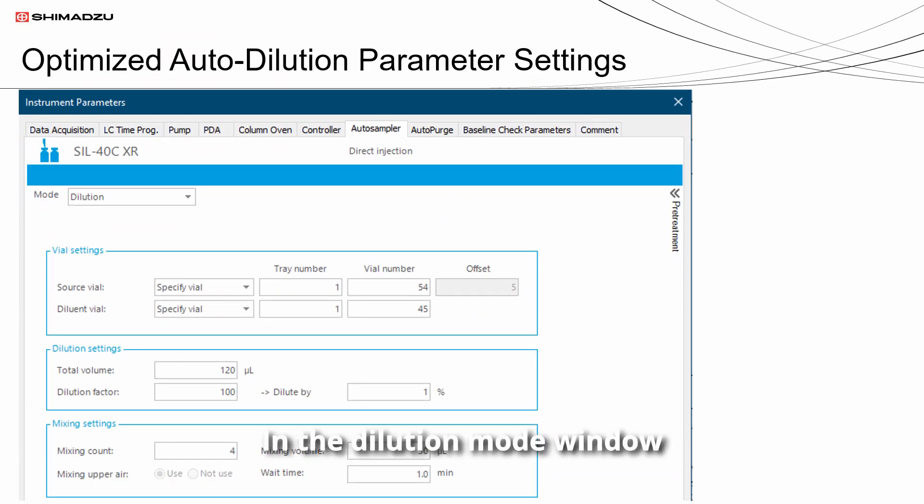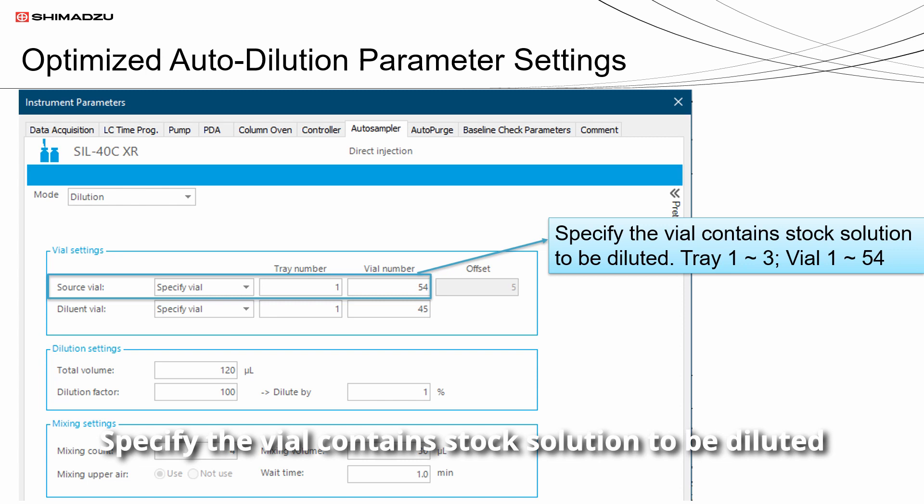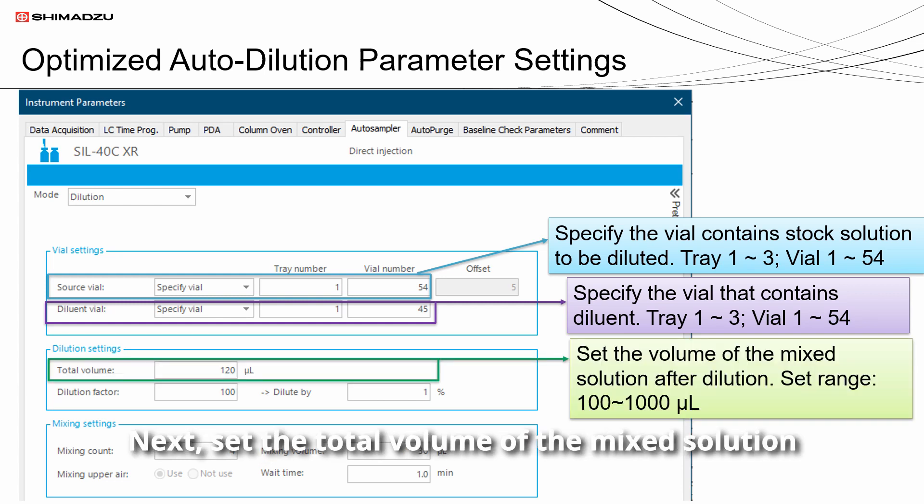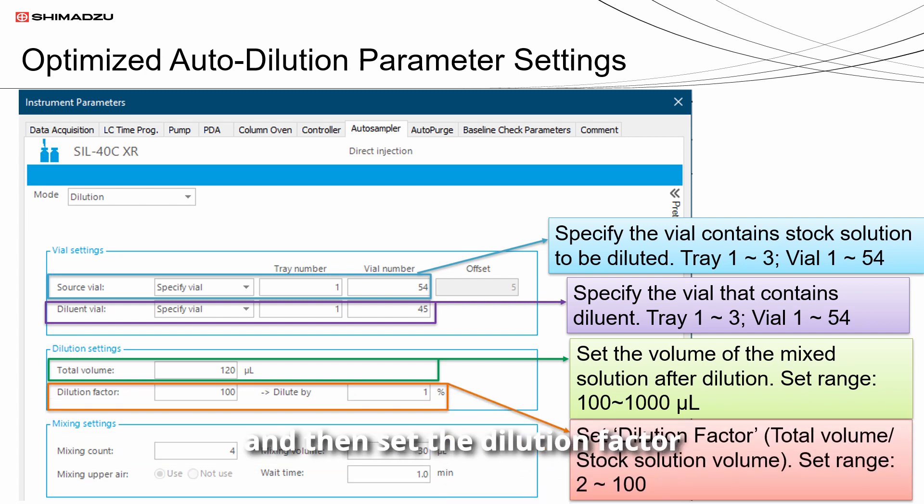In the dilution mode window, specify the vial that contains stock solutions to be diluted. Then specify the vial that contains diluent. Next, set the total volume of the mixed solution after dilution. Setting range is 100 to 1000 microliters. Then set the dilution factor, and the setting range is 2 to 100.